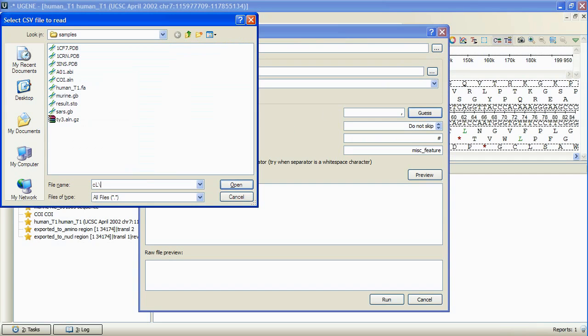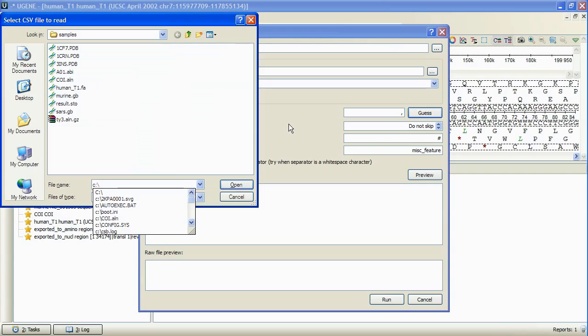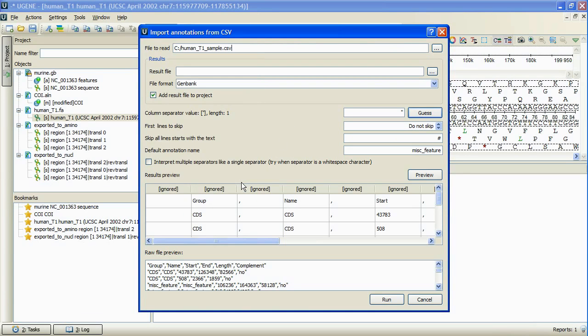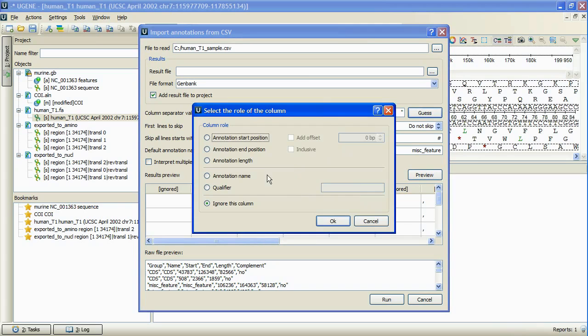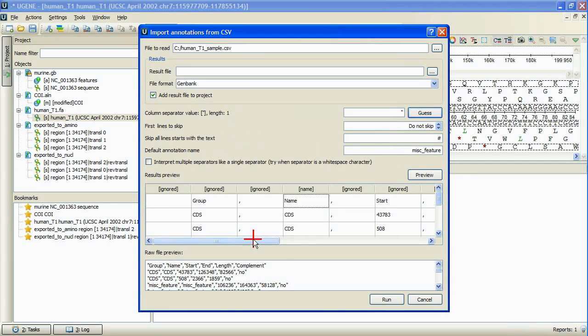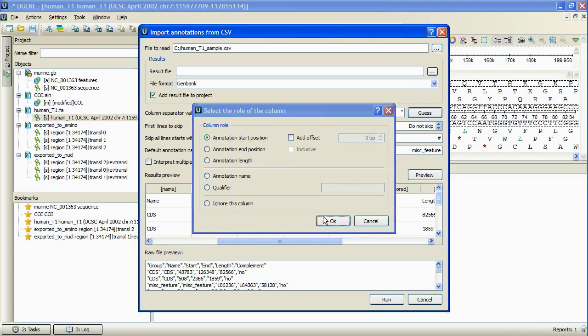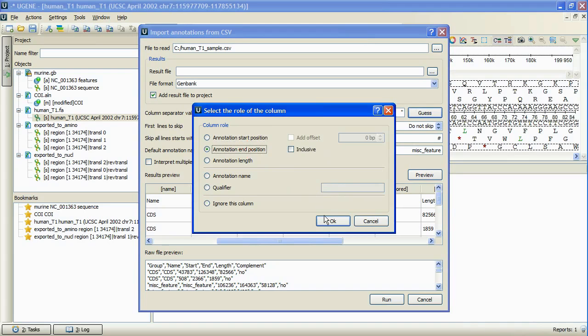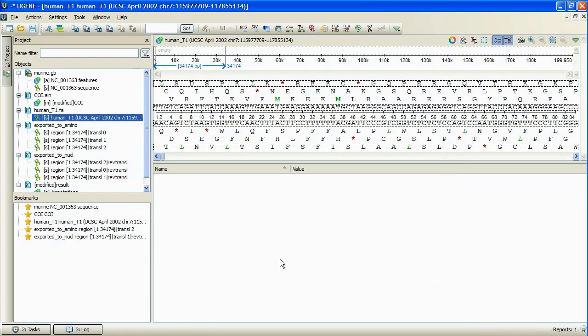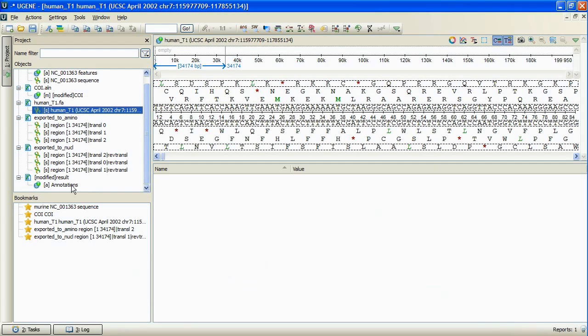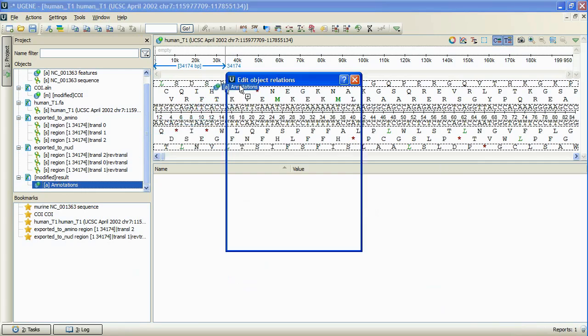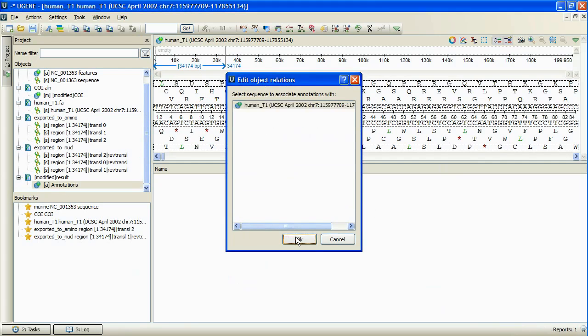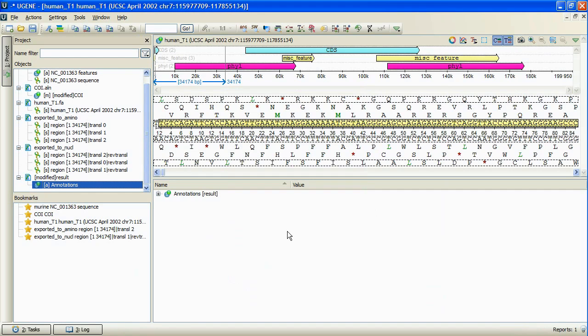For example, this one. By pressing preview button, we can bring up the raw and the resulting views of the annotations contained in the input file. By the way, the feature was requested by our user Andy Krause.